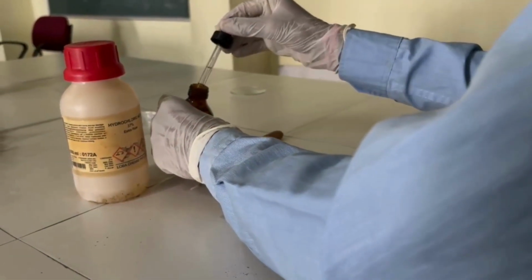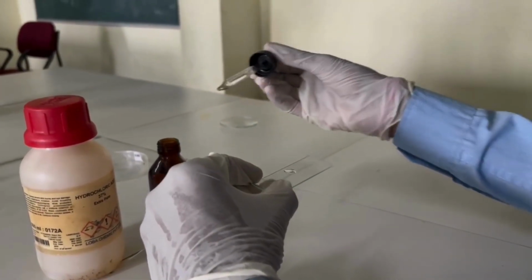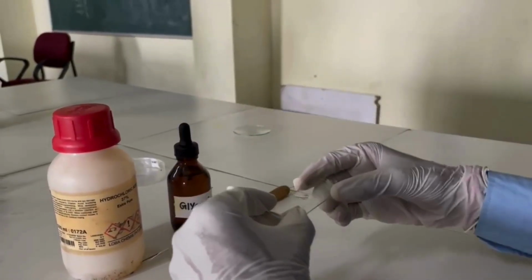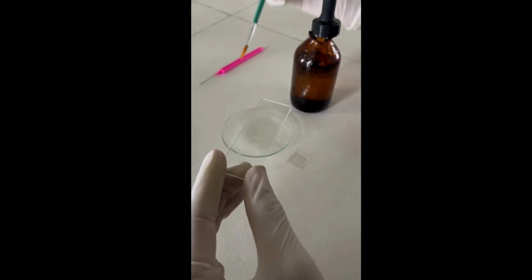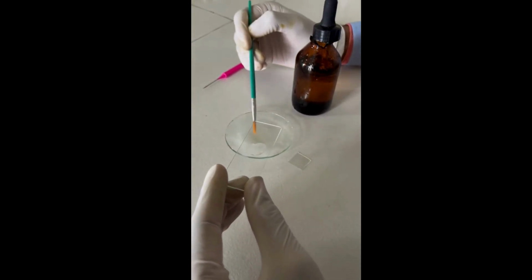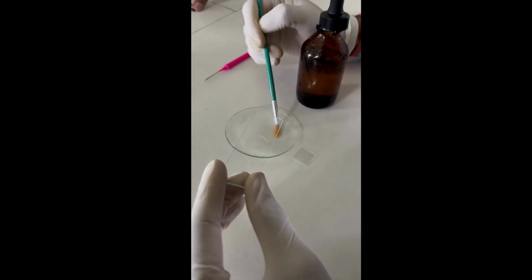Preparation of slide. 10 minutes after staining the section, it is kept on the slide along with 1 drop of glycerin and adequate amount of water droplets. Adding excess of glycerin makes cover slip difficult to handle and results in poor quality of images under microscope.